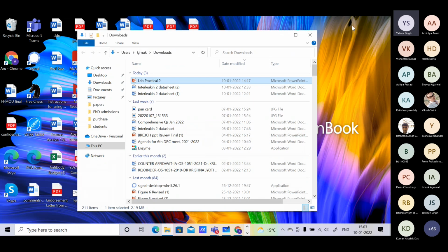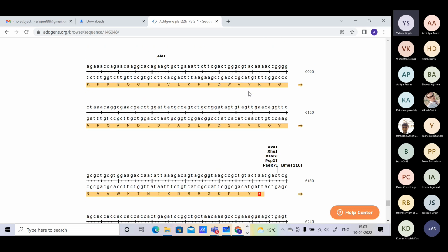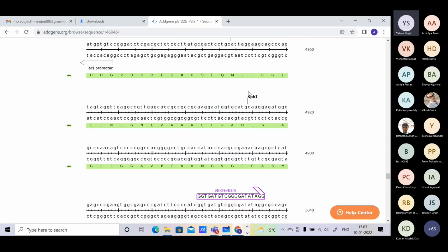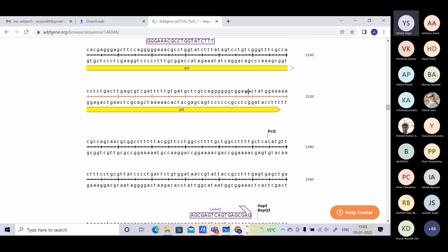Okay, so I have given you the introduction. There is some problem we are facing. I don't know why it is not copying. It is usually good at copying, and I don't know if Teams is interfering. We will also show you the mother software using which these gene files have been prepared. That will be for the next class. But right now I hope you understood how to find the parts which are actually required. Any questions regarding this, any clarifications?